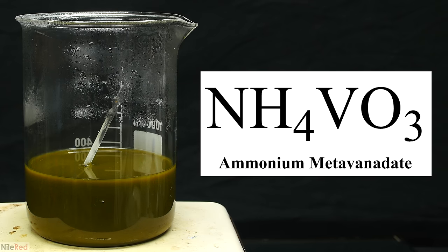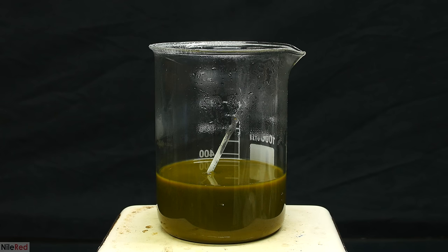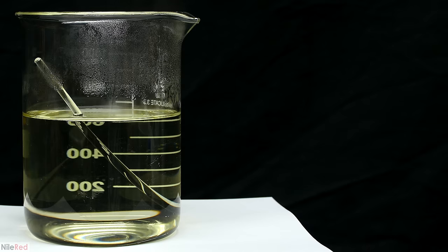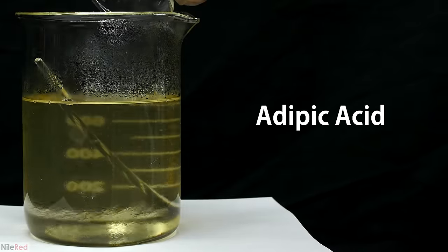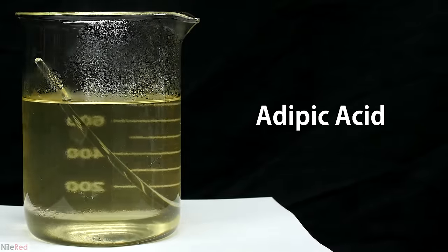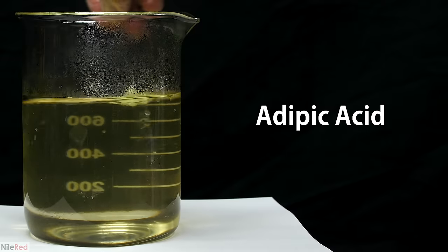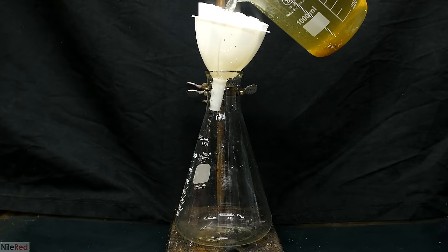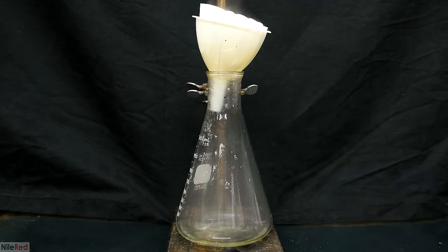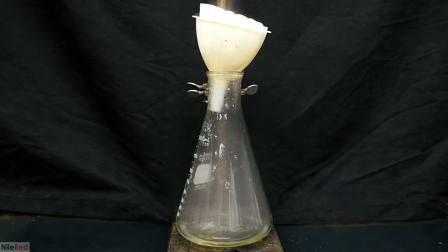Ammonium metavanadate is a vanadium-based white inorganic powder with the formula NH4VO3. Its two main uses are as an intermediate in vanadium purification and as a catalyst in chemical reactions. I plan to use it for the latter reason, to catalyze the oxidation of cyclohexanol to adipic acid. Adipic acid is a precursor to nylon, and I think it might be cool to do some polymer chemistry.